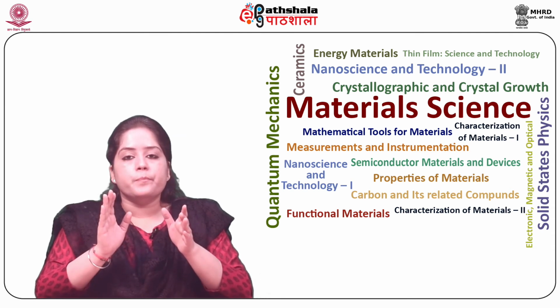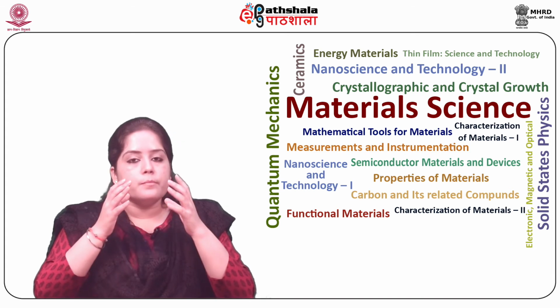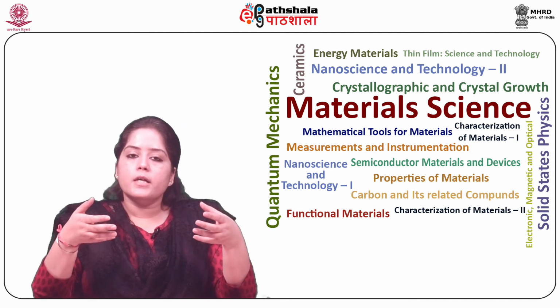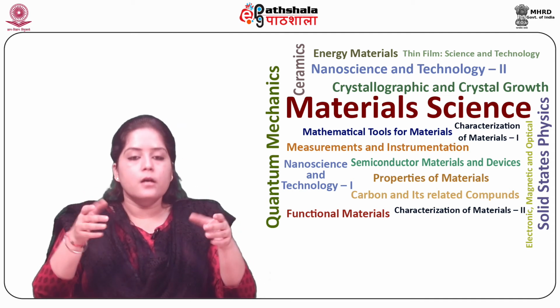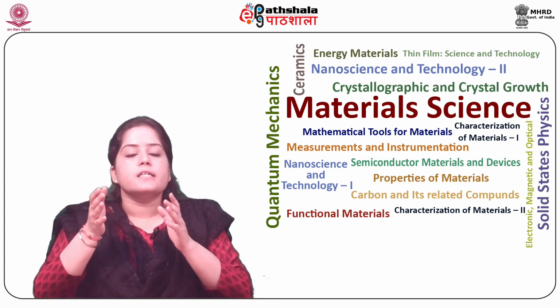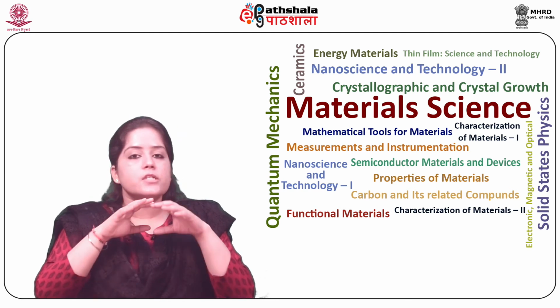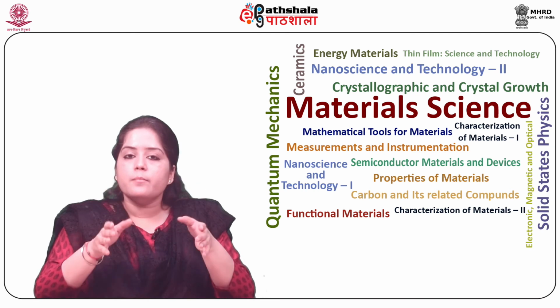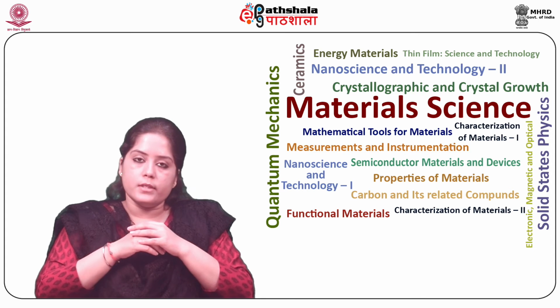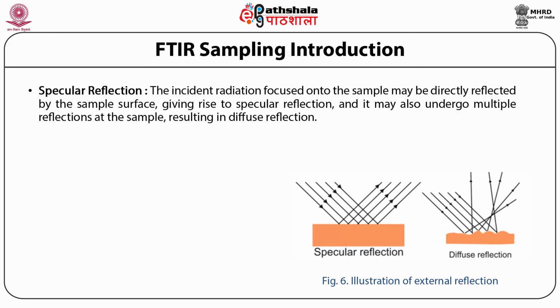Most importantly, the improved spectral acquisition and reproducibility associated with this technique leads to better quality database building for more precise material verification and identification. So ATR is clearly an extremely robust and reliable technique for quantitative studies involving liquids. Next is the specular reflection.